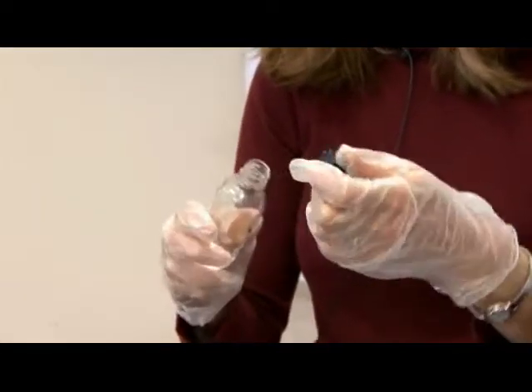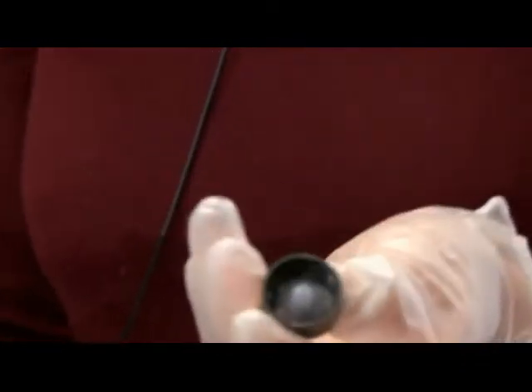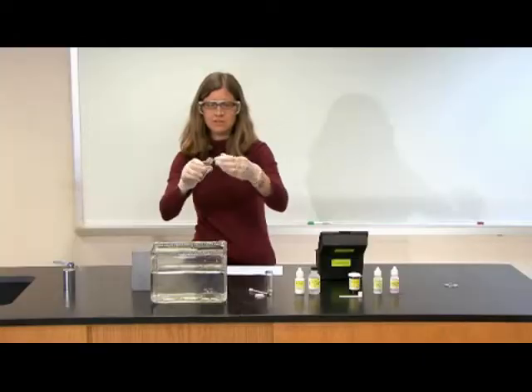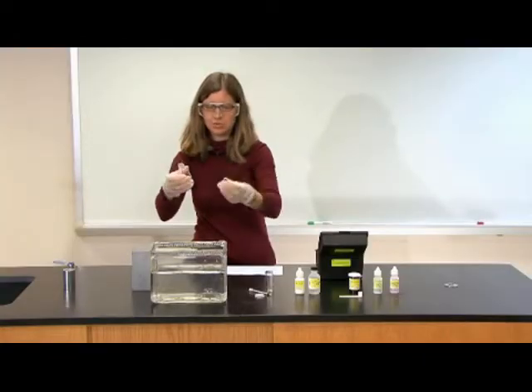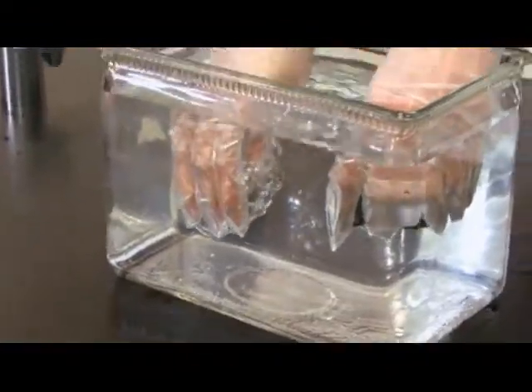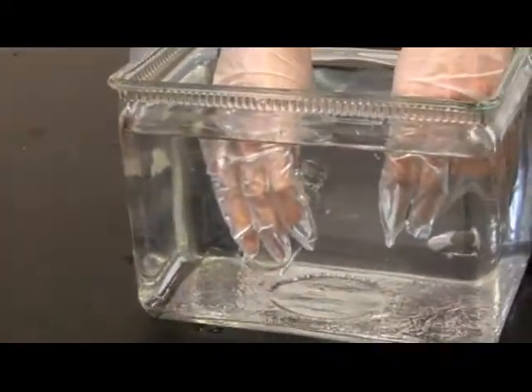I would unscrew my water sampling bottle, and it's a specialized kind of bottle where the cap actually has a little indentation in it to leave a little extra room for you to add your chemicals later. I placed both my cap and my sample into the water that I'm collecting.